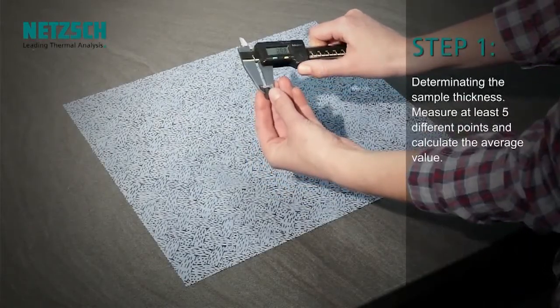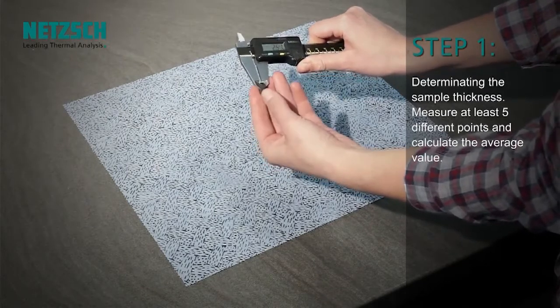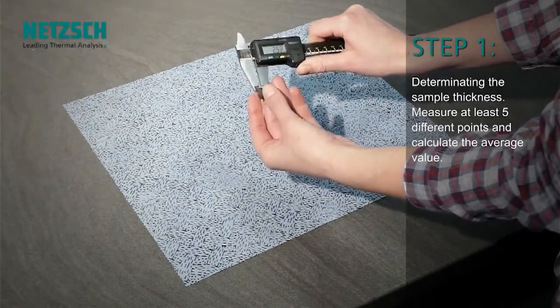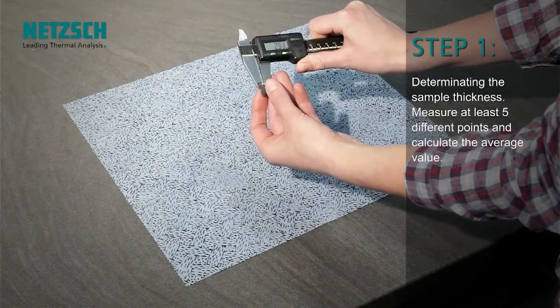First, the sample thickness must be determined. Measure at least five different points of the sample and calculate the average value.